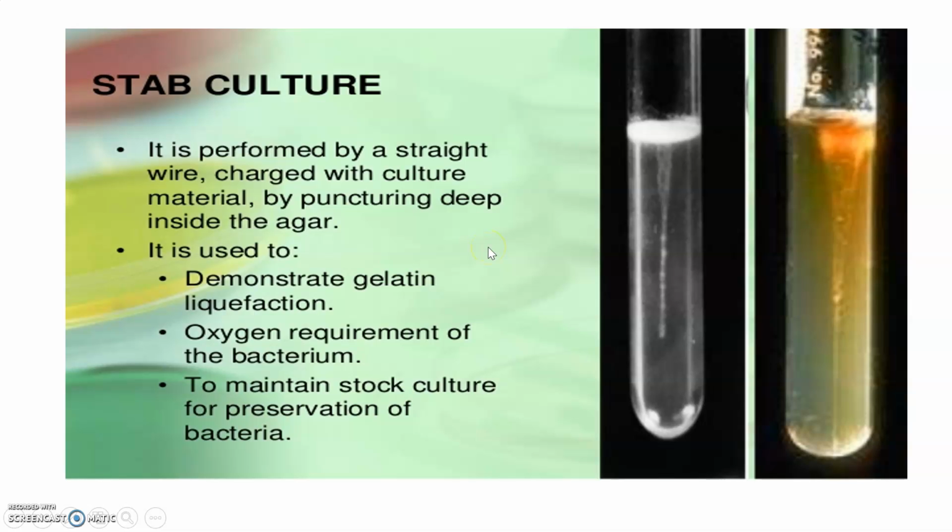This is used to demonstrate gelatin liquefaction. It is also a method to check the oxygen requirement of bacteria, whether oxygen is required for that inoculated organism. And it is used to maintain the stock culture for the preservation of bacteria. So this is an excellent method for preserving the bacteria, to maintain the bacteria in the viable state.